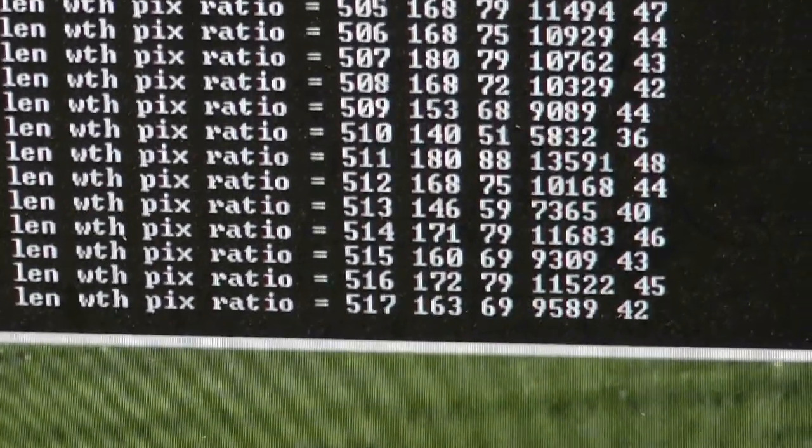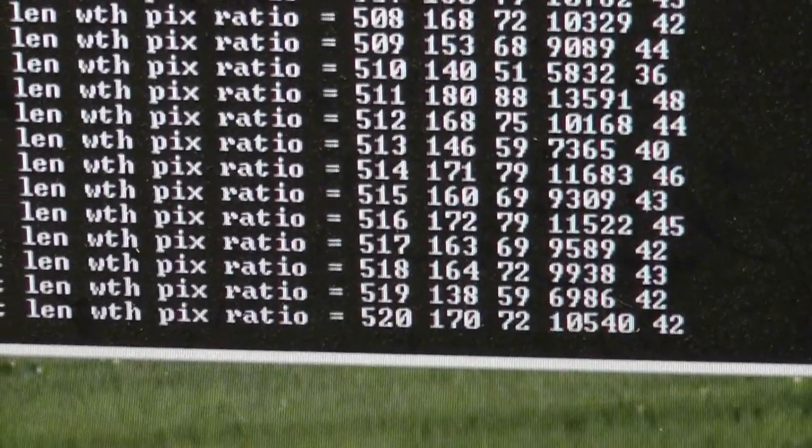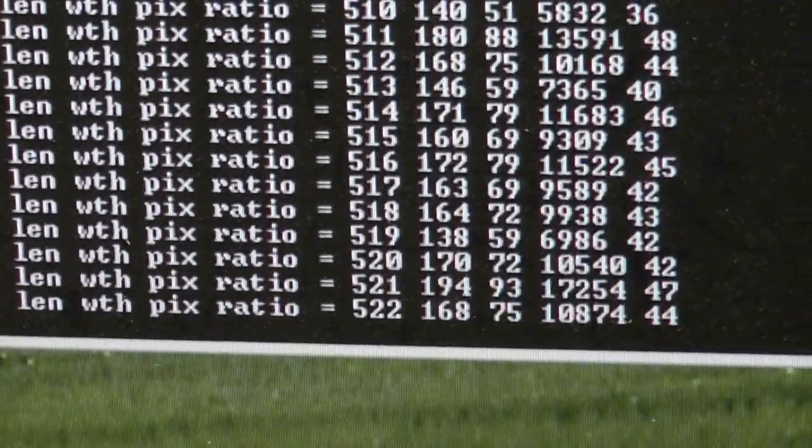And in the time that we've been doing this, it's done a little bit over 500 kernels.